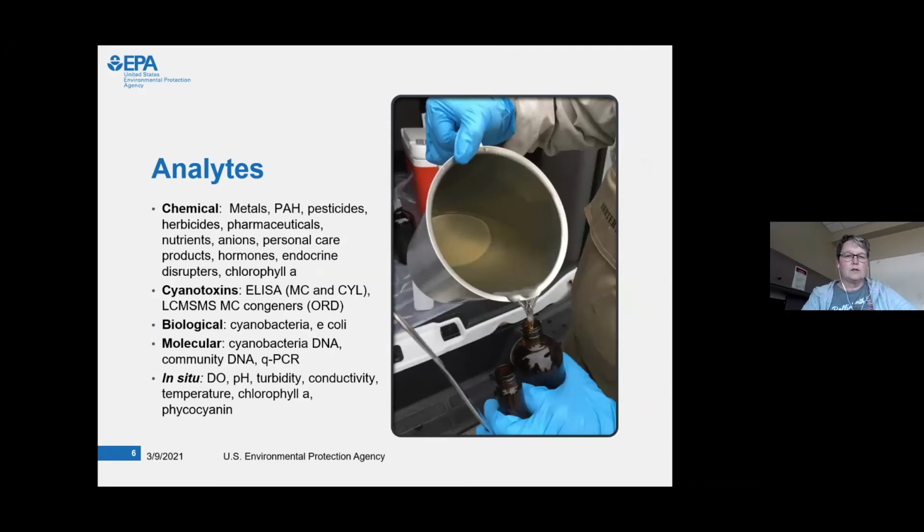We had a large suite of analytes we were looking for, everything from metals and PAHs, pesticides, down to cyanotoxins, both by ELISA and LC-MS. We did biological work, looked at E. coli as well as cyanobacteria under a microscope, did the molecular work, and then in situ parameters.